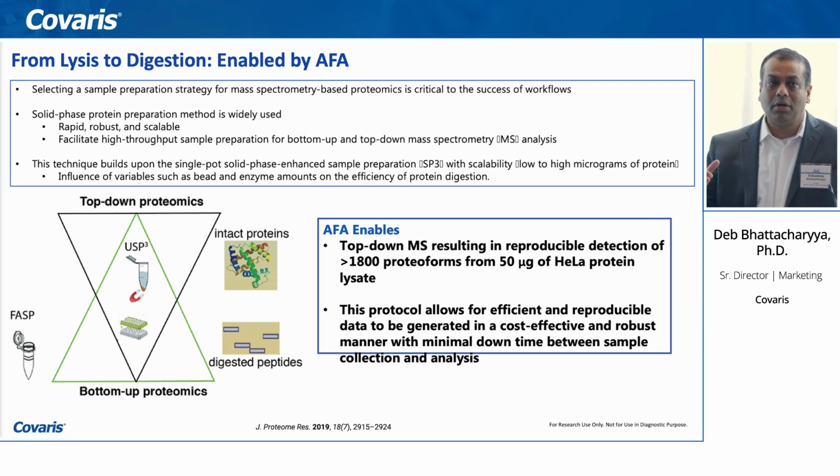And at a lower power, you don't necessarily break everything down into the smallest fragments, which is why we once again say, and you will see this data again and again during Saeed's presentation, I'm assuming, that we also see that in the presence of this particular energy hitting the sample when you're doing digestion, it expedites the whole digestion process efficiency without adding any additional miscleavages or any additional post-translational modifications.